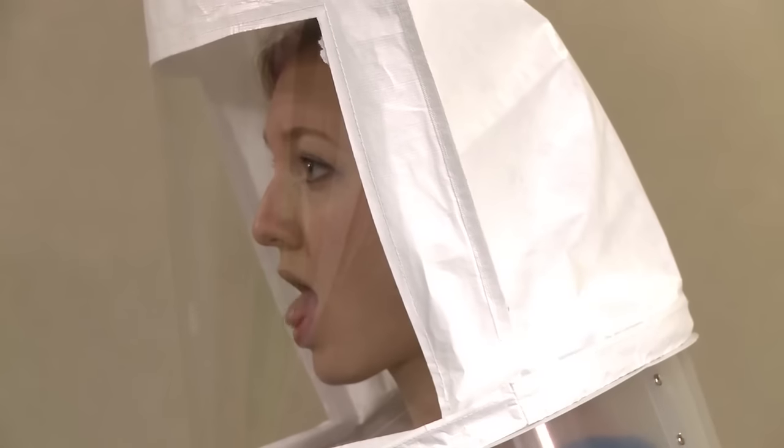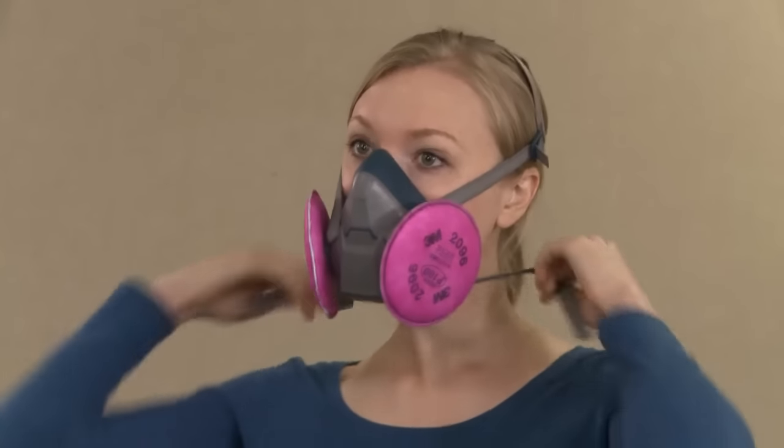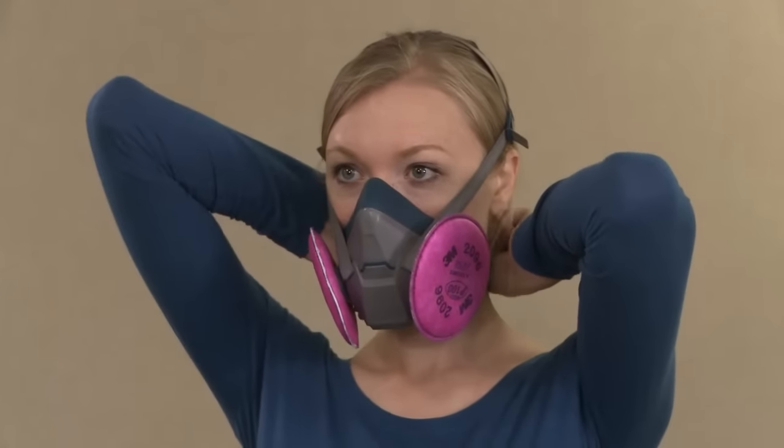Once it has been determined at what level — 10, 20, or 30 squeezes — you can taste the test agent, you'll remove the hood and wait a few minutes to clear the taste from your mouth. Rinsing your mouth with water may be helpful. Next, put on your respirator following all instructions for proper fitting, including a user seal check, as taught during your training session.